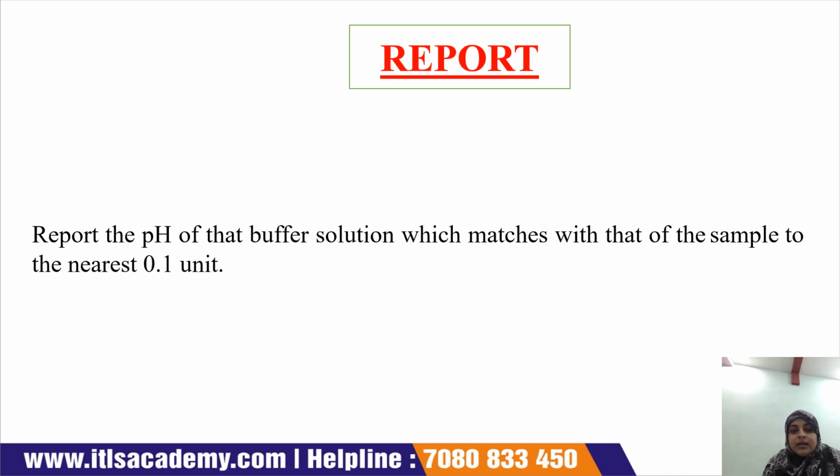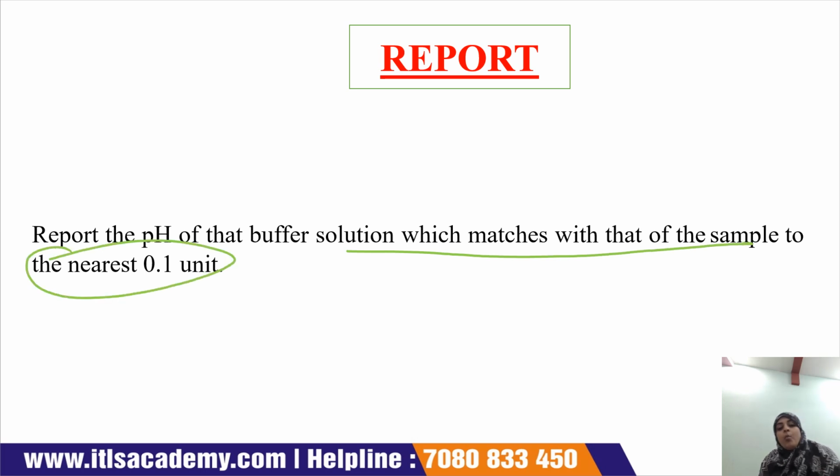Now the next is your report. Report the pH of that buffer solution which matches that of the sample to the nearest 0.1. So this is all about the measurement of pH by the colorimetric method. I hope you will understand.